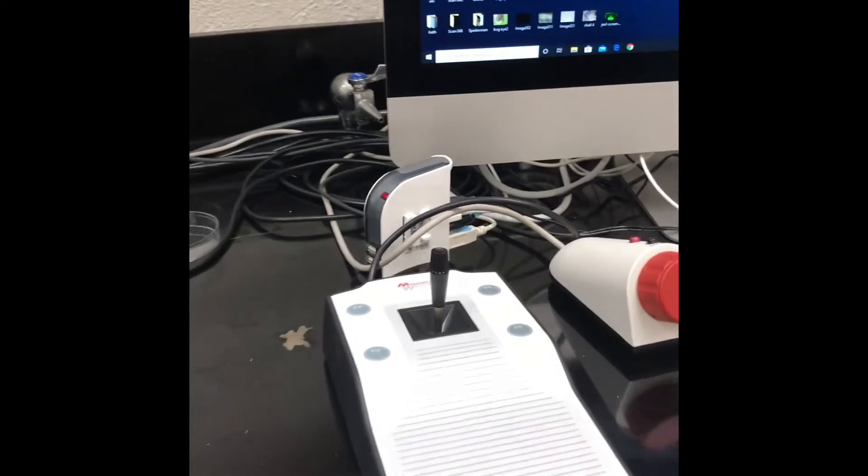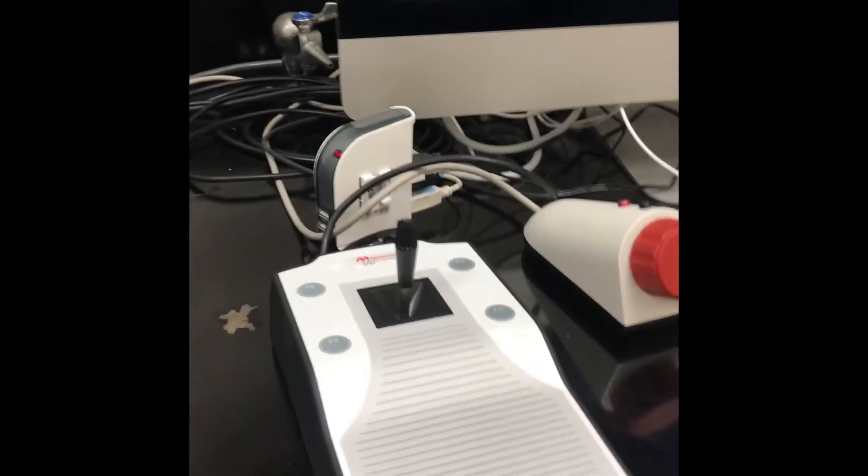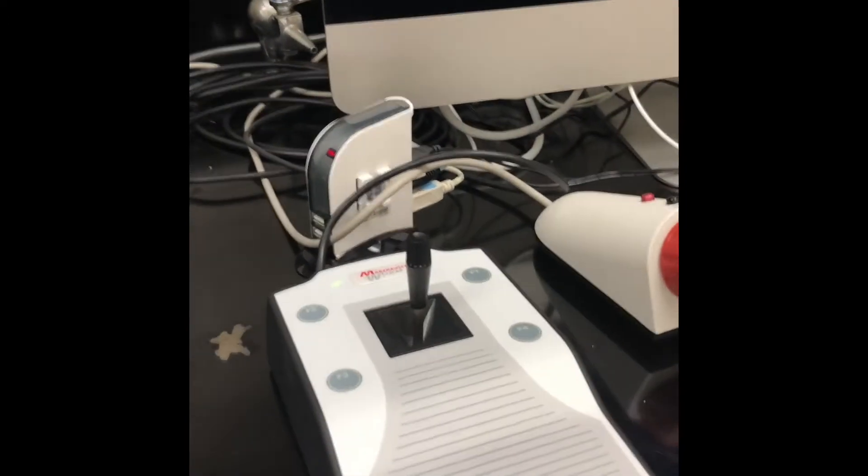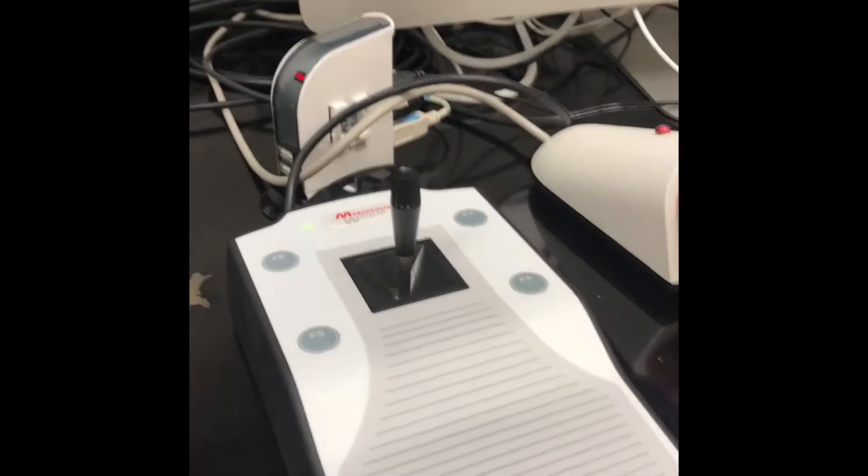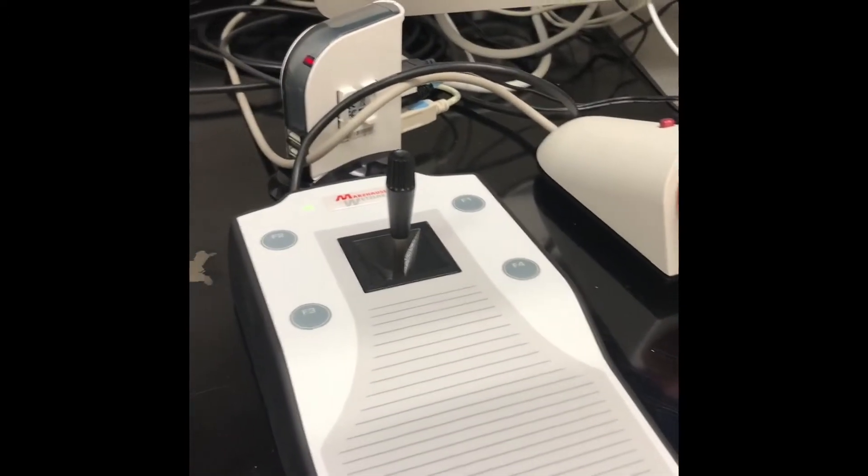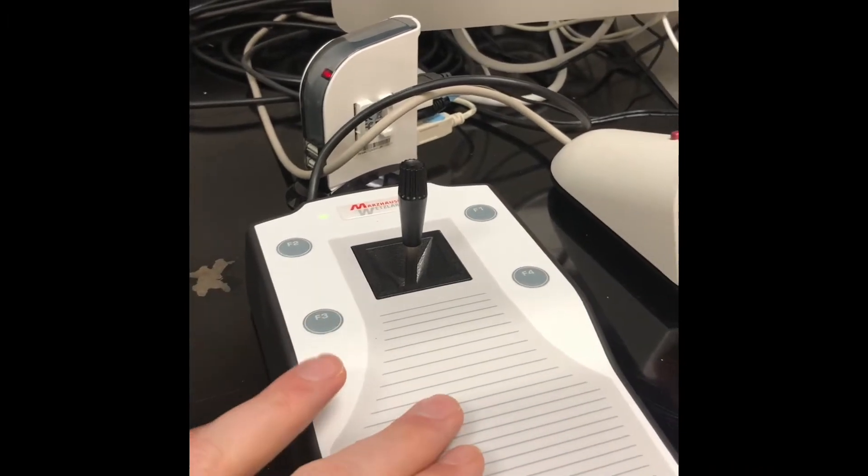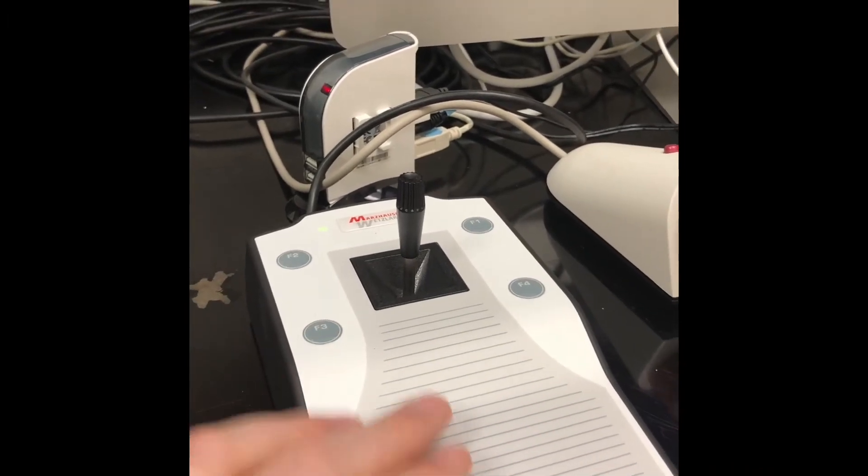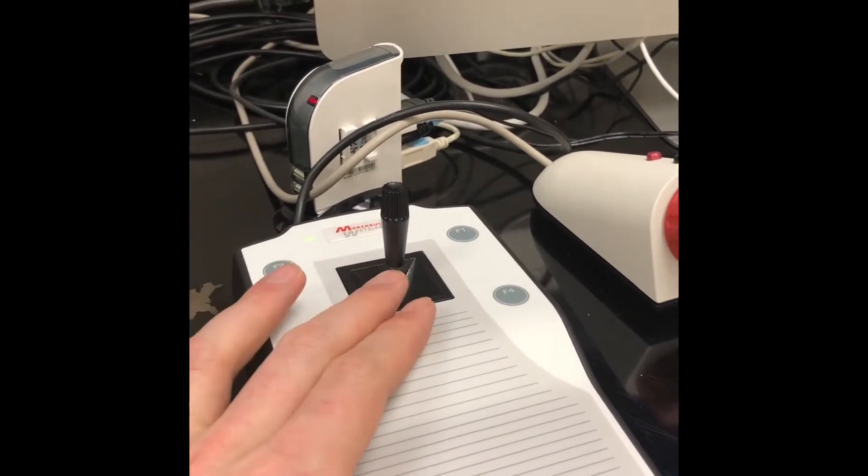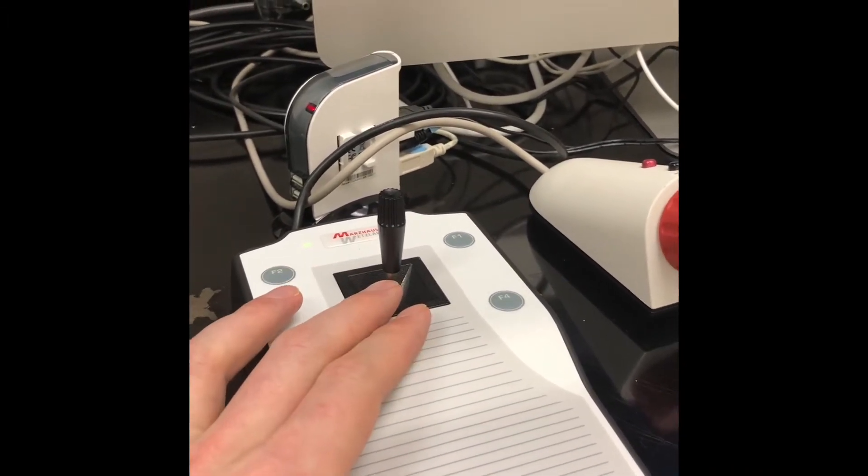The microscope also has a joystick, which can move the powered stage in the X and Y direction.